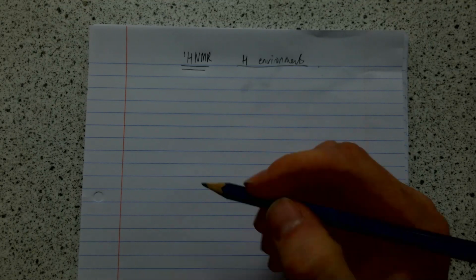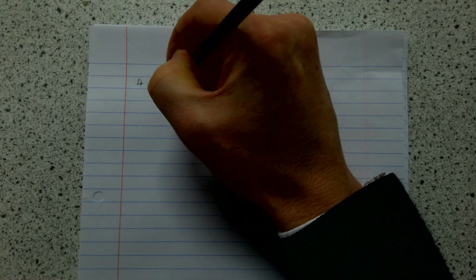Now, we spent some time in class talking about how it works and some things you need to know about running it. We don't actually need to know those, I don't think, for the spec. We're going to focus on what information you get and what the spectra look like. So the first thing that I remind people is there's 4 things to try to remember when doing NMR. So always remember 4 things, and we're going to go through this one at a time.